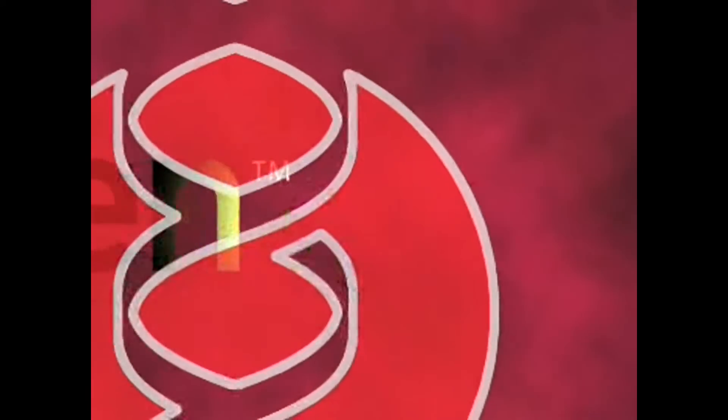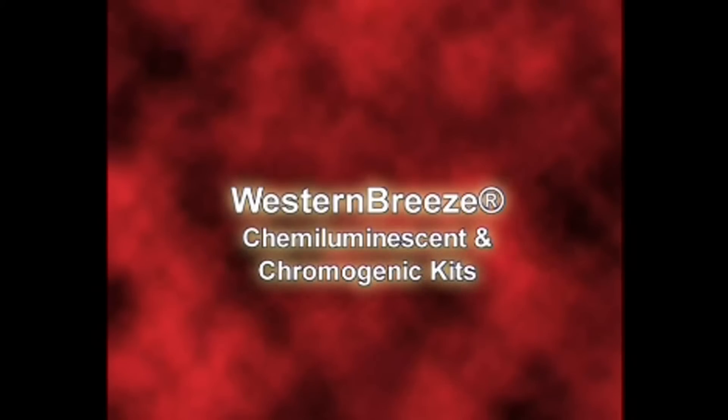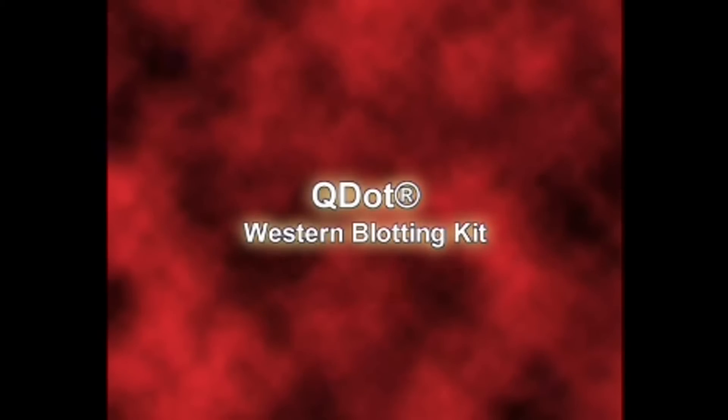The iBlot dry blotting system is complemented by the proud family of Invitrogen products, making Western blotting efficient and easy.